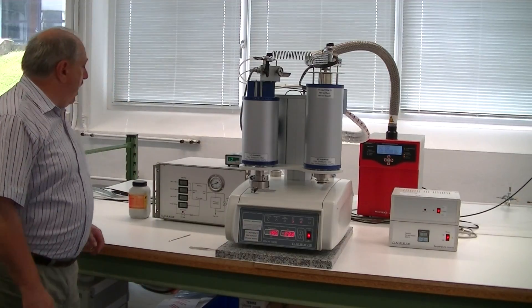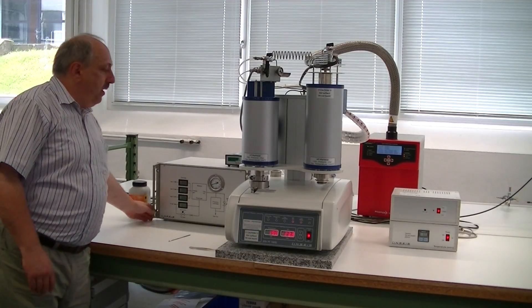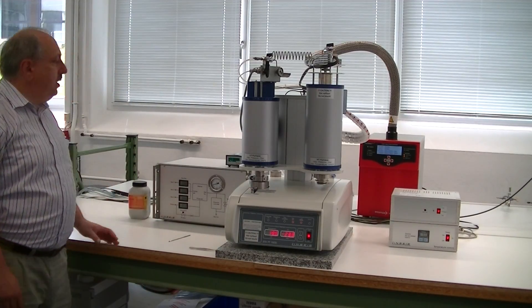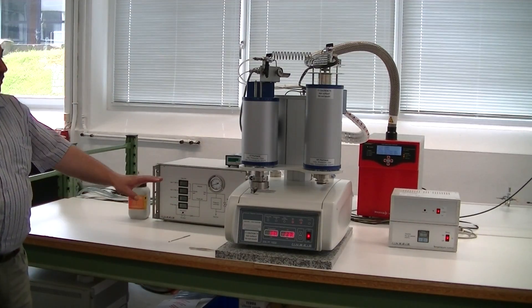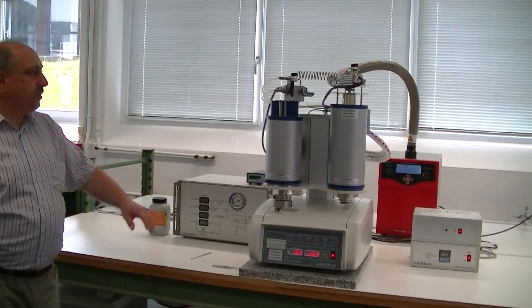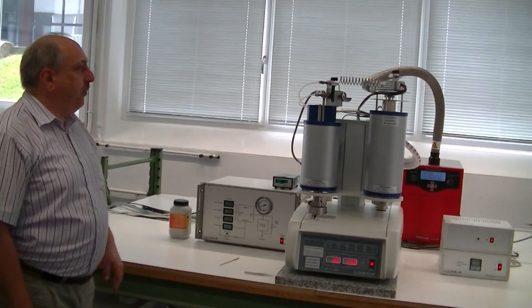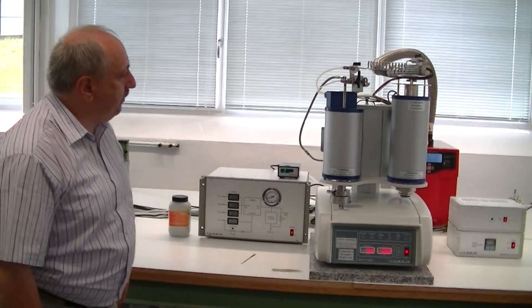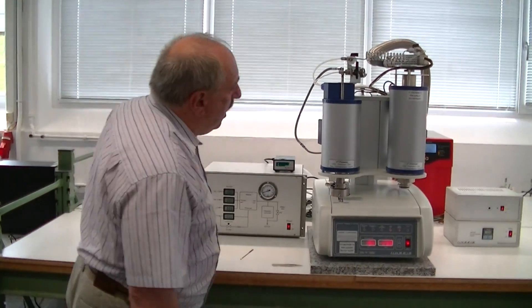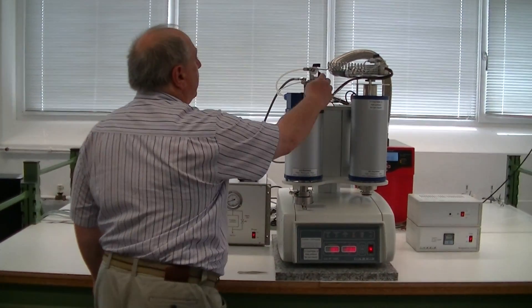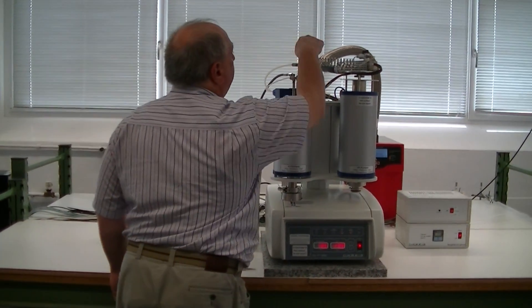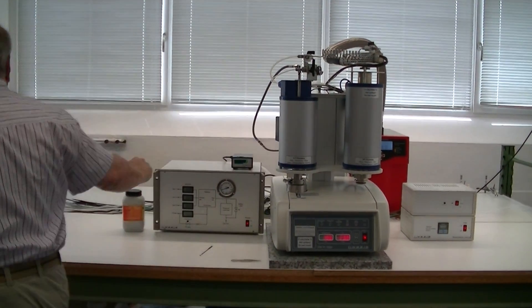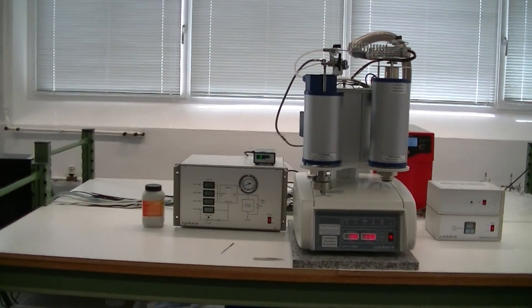To start the system, when everything is closed, we have to evacuate the system. We have to go to the vacuum pump. All valves should be closed, outlet valves. And then we can evacuate the system.